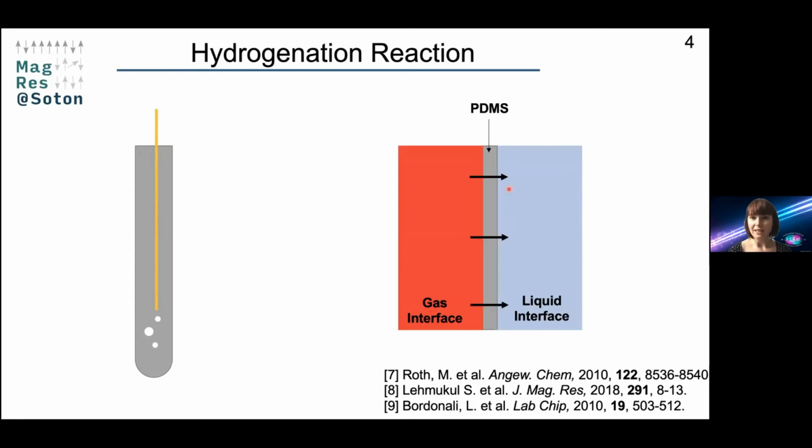So what we've done is we used a semi-permeable PDMS membrane, which allows the gas to dissolve into the liquid interface.